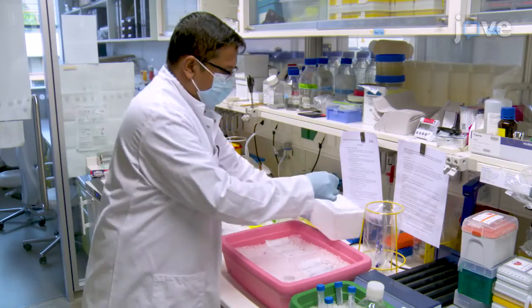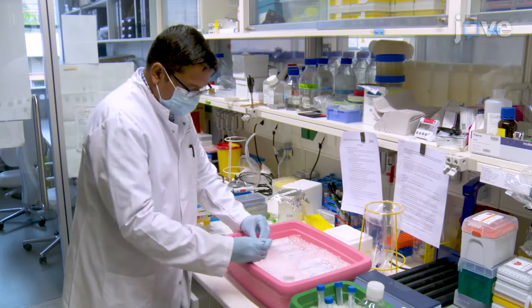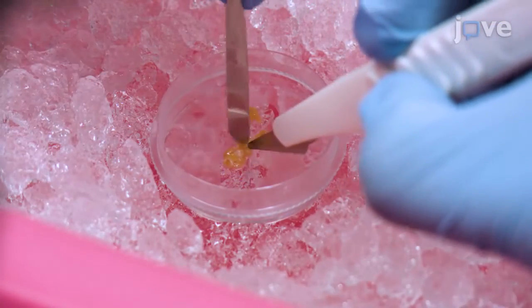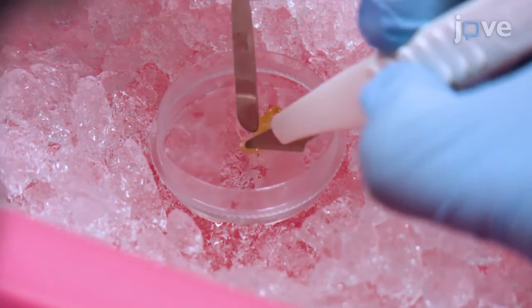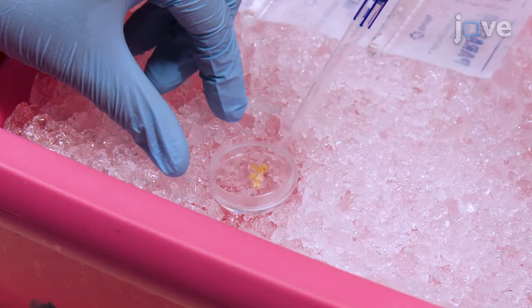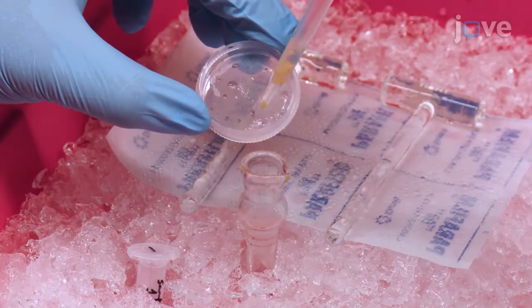Begin by transferring 10 to 60 milligrams of fresh frozen tissue sample to a pre-chilled petri dish. Mince or chop the fresh frozen tissue with a razor blade into small pieces on ice. Add 500 microliters of chilled nuclei lysis buffer onto the tissue in the petri dish, then transfer the mixture to a douncer.